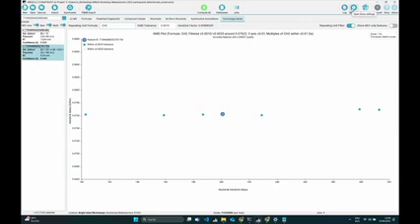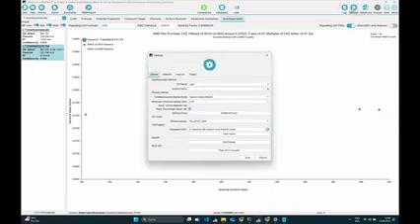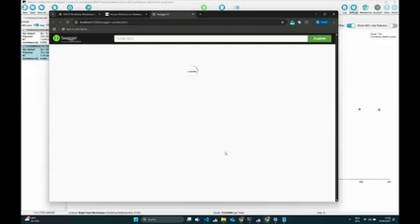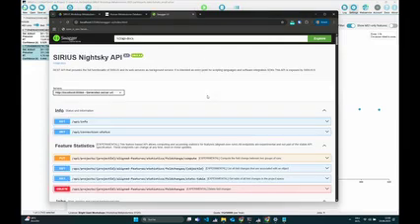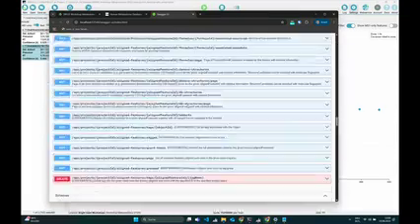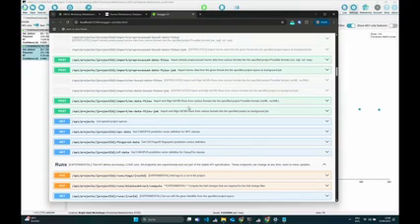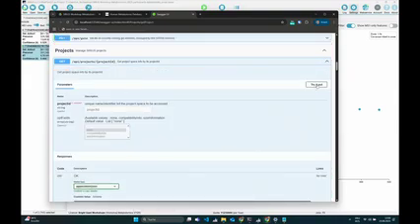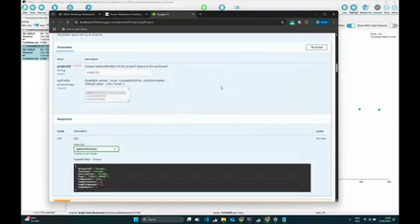It might also be that a lot of you are not interested in this, but people who want to script a little bit, if you go to the settings button, in the bottom you can see this open API in browser, and if we open this, you will just now in a few seconds get an overview on all the API functions which are exposed and which you can use. But yeah, I don't want to go into this in detail. This is a little bit interesting if you want to see what is possible and if you just want to try out stuff. So for example, you can just click on something and click this try it out button, and then you can just really try out what output you would get for a particular input.